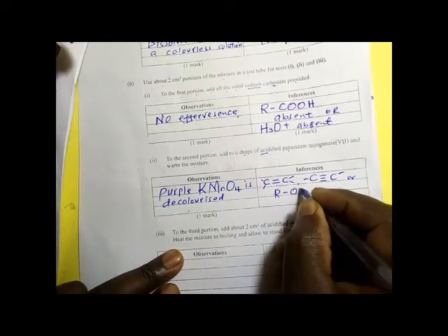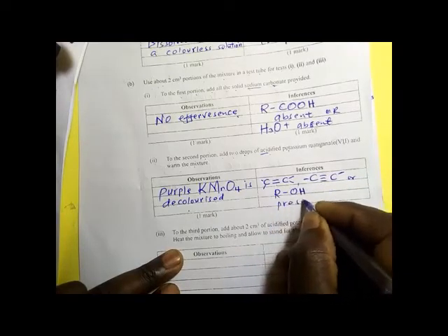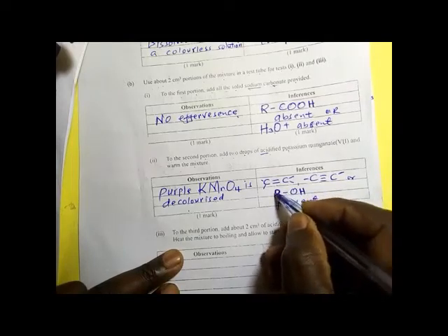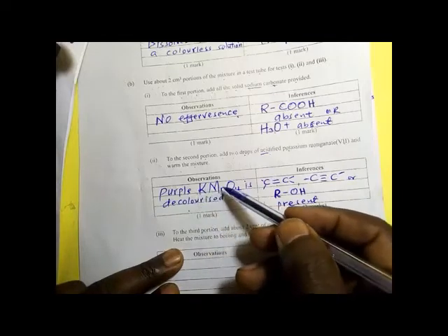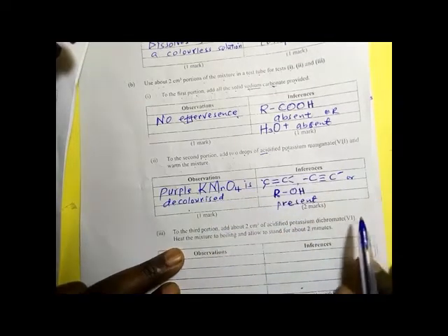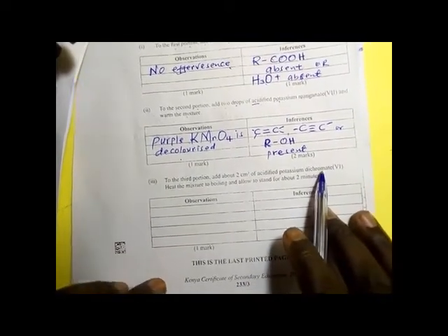Or an alcohol is present. This one we write all of them, the 3 of them. They could be present when purple acidified potassium permanganate is decolorized. Then these 3 are suspected to be there.